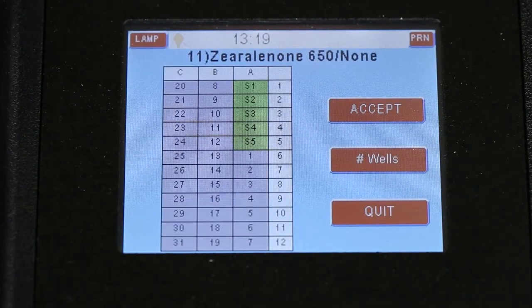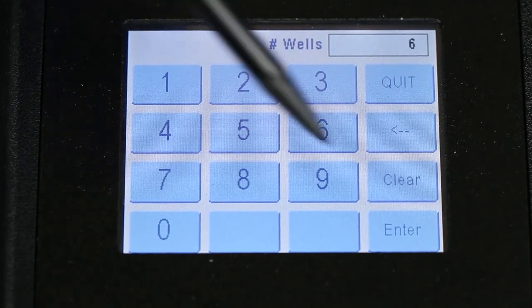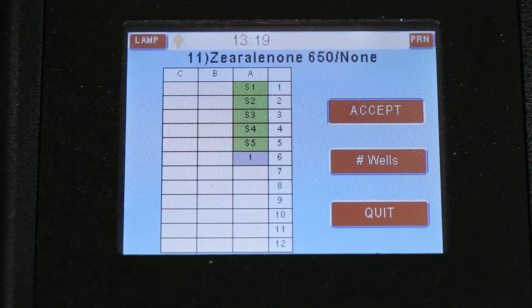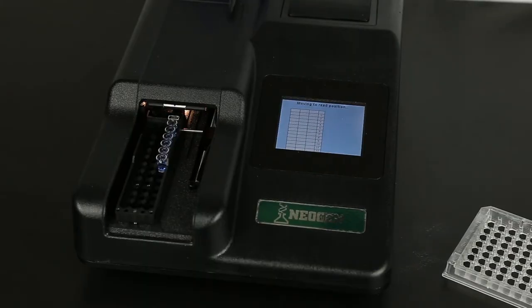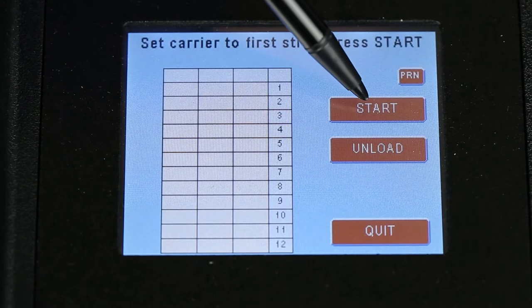Select the number of wells you want to read by pushing number wells, then press select. Set the carrier to the first strip and place the microwell strip in the carrier with the zero control entering the reader first. Press start.